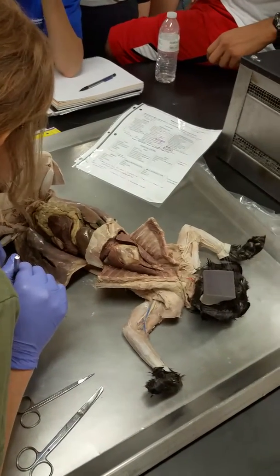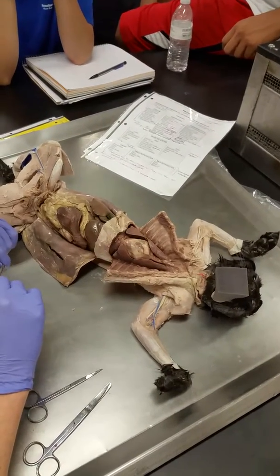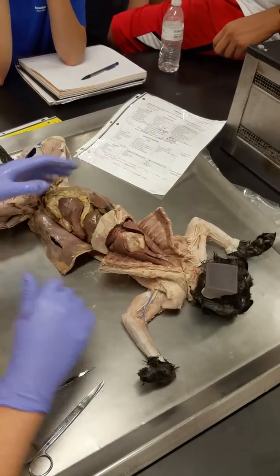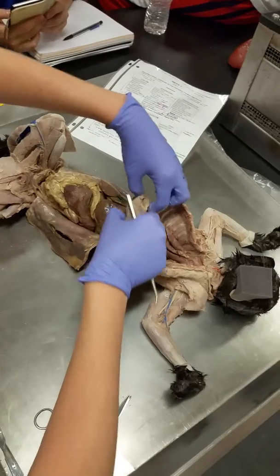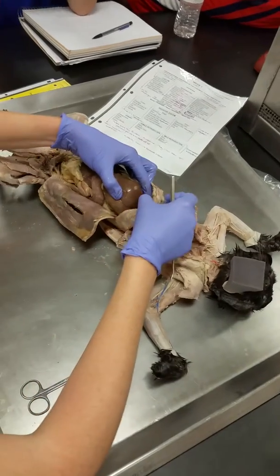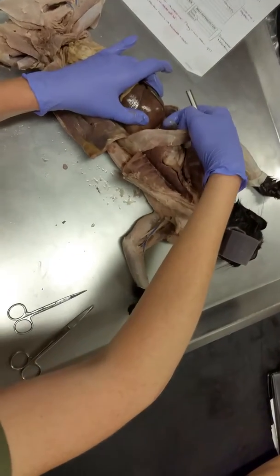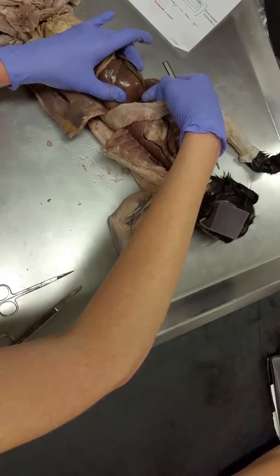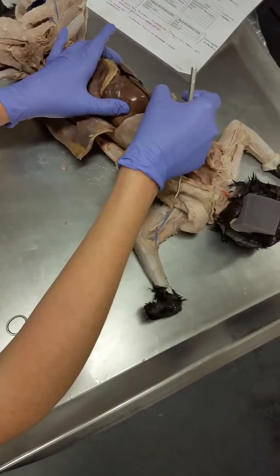Let's see. Oh, then mesenteries. Do you guys remember the dorsal mesentery and the ventral mesentery? So we actually get to see what those structures have become. He's really fuming on the inside. Okay. If we look at the liver here, so we've got our diaphragm, and I'll turn it around so you guys can see it. If we pull down on the liver, can you see this little clear thing right there attaching the liver to the diaphragm? You see that? That's the falciform ligament, and this falciform ligament is made of ventral mesentery. Okay, so this is ventral mesentery here. So it's that little clear thing right there.